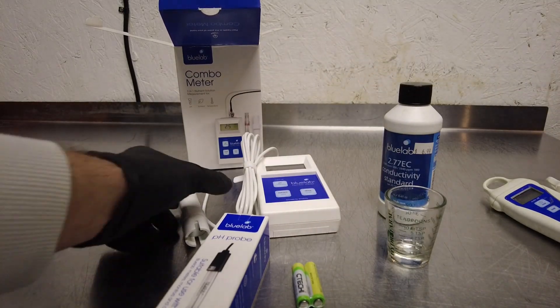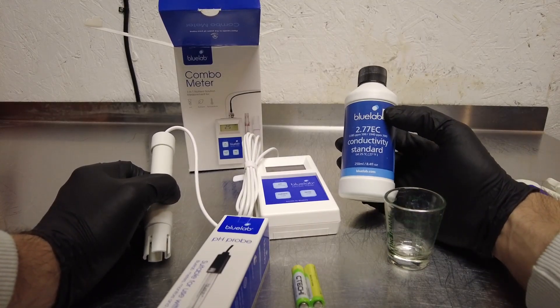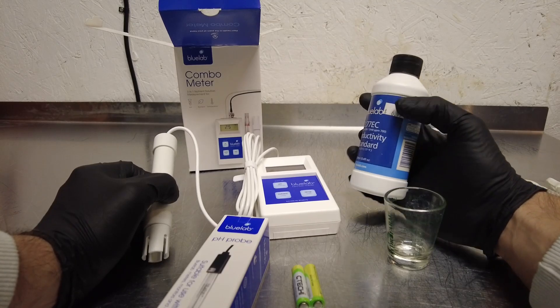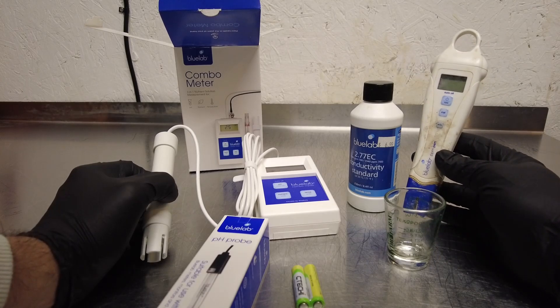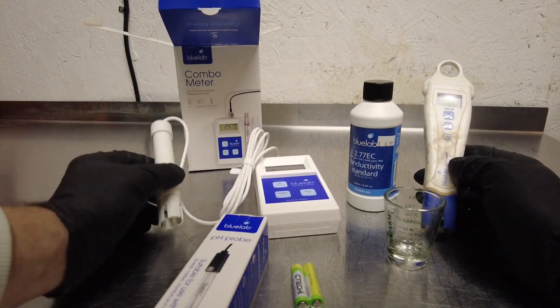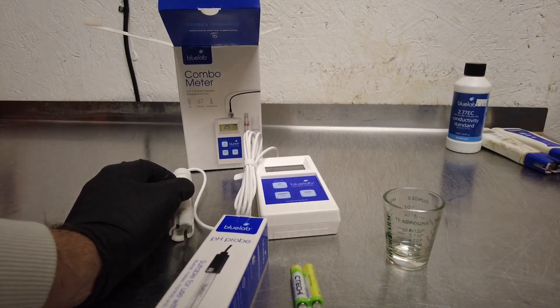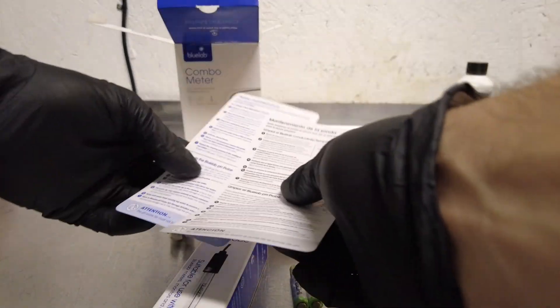I have this 2.77 EC conductivity fluid, which you use to make sure your EC or PPM pen is calibrated. But I read the manual and for this unit you don't need to calibrate the EC probe at all — it says so. So we're going to go ahead and shove that off to the side.